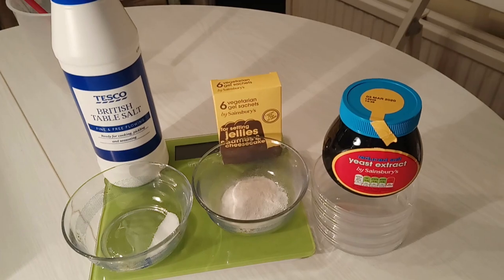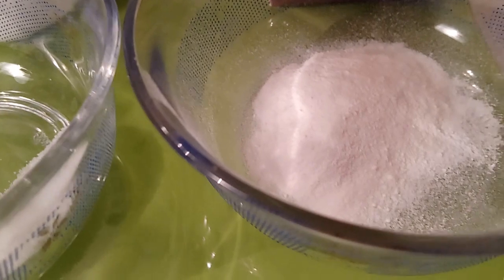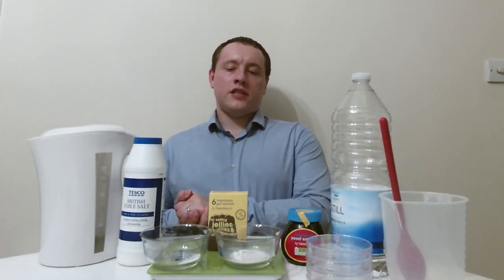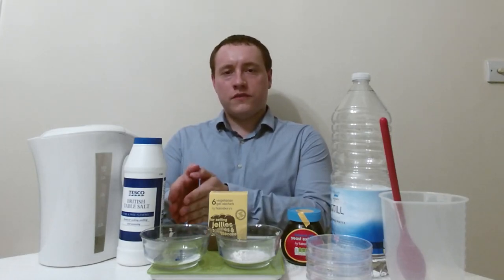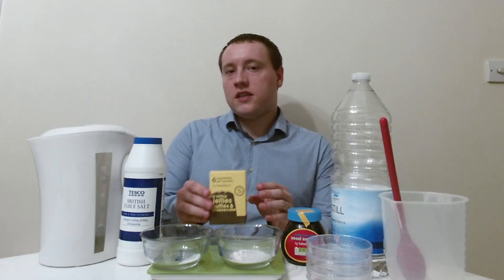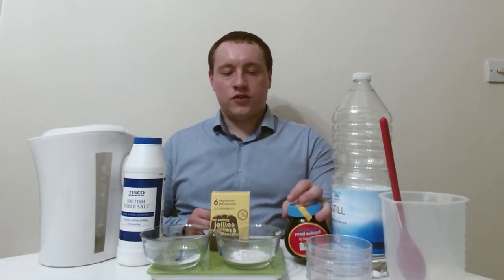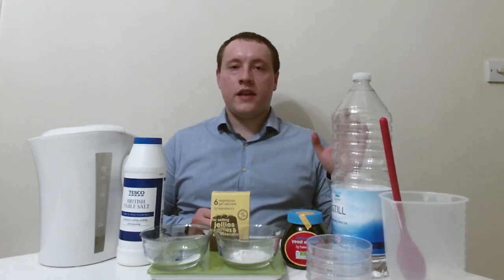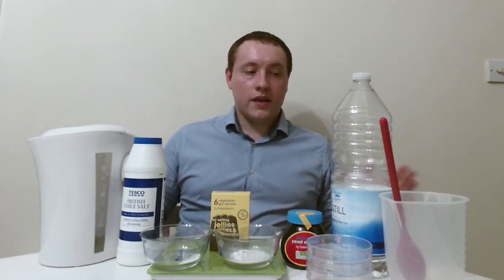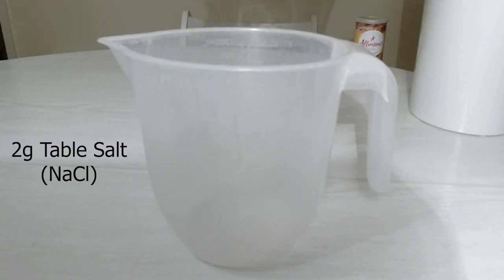First, you need to weigh out the amount of powder you're going to be using. The ingredients involve about two grams of salt, one sachet of vegetarian gelatin which is roughly six and a half grams, and one gram of reduced salt yeast extract. That will all be dissolved in about 300 millilitres of boiling water. Now that I've got all of these ready, all I need to do is boil the water and start mixing them all together.